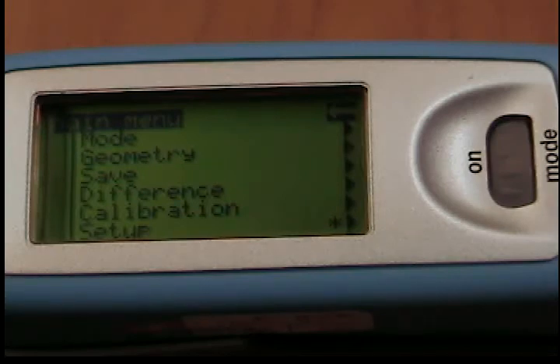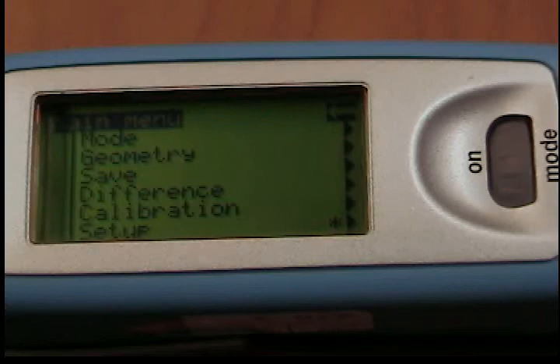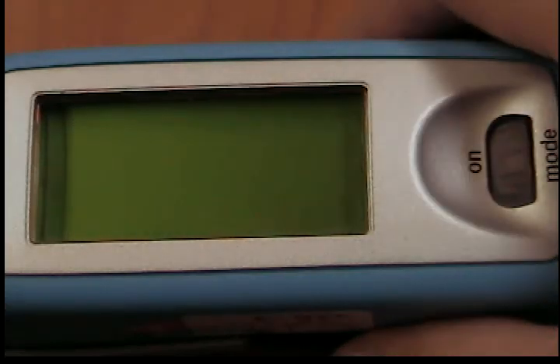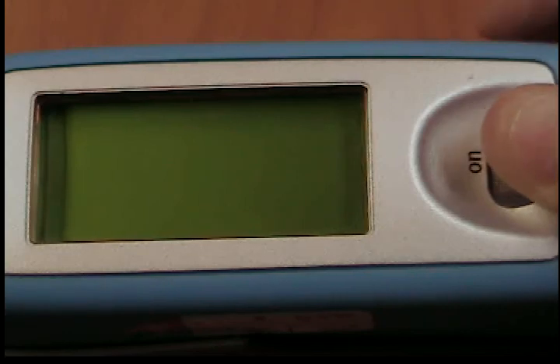You can quickly switch back from the menus to the measurement display by using the operate button. In some cases this button also has another function but that will be indicated in the display, for example confirm operate.